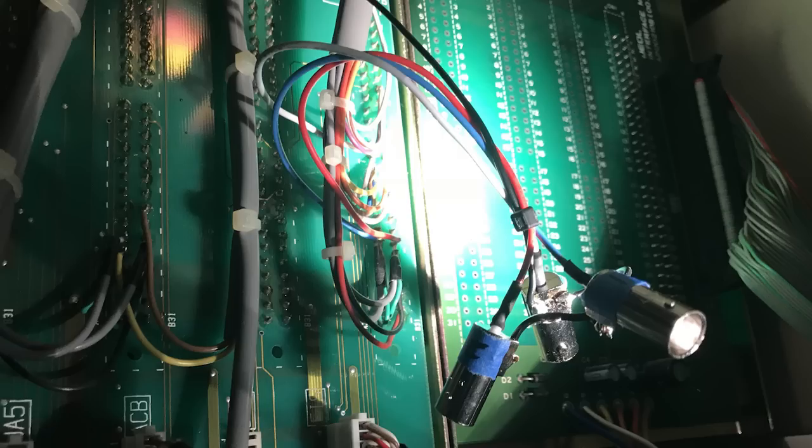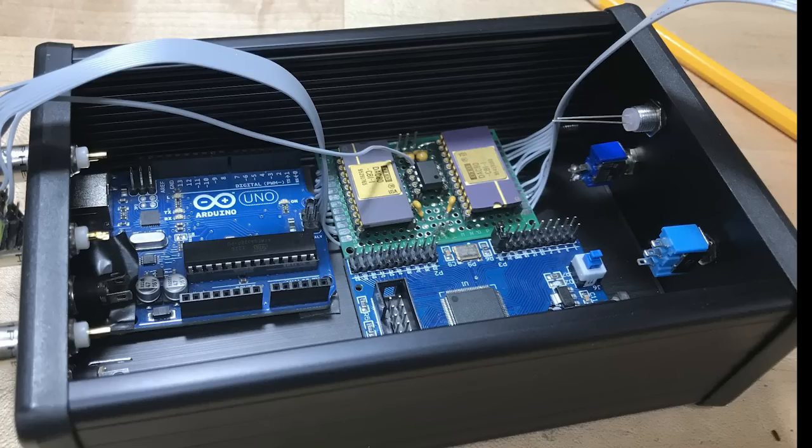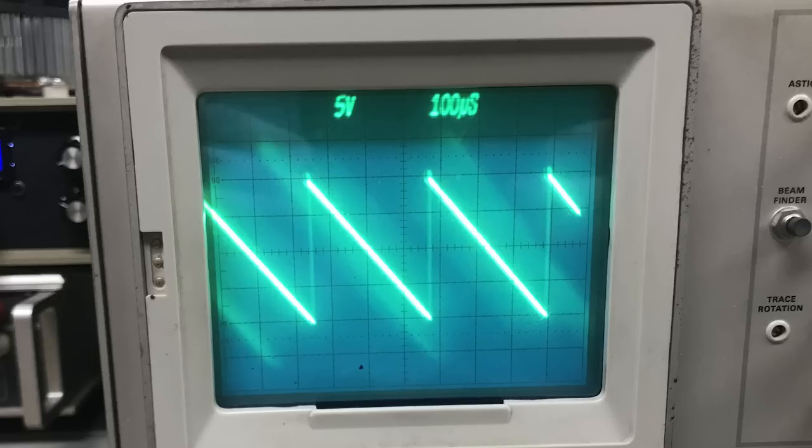It's got a third connection, which is an external scan enable. I don't have the connector for this, so I just added these BNCs onto it. Next up, I had to build the computer interface for this, so I used two 12-bit DACs, which turned out not to be quite enough. They had a current output, so there's a trans-impedance amplifier, which gives a plus or minus 10 volts output to drive the microscope. That's driven by a CPLD and an Arduino with a USB connection to PC.